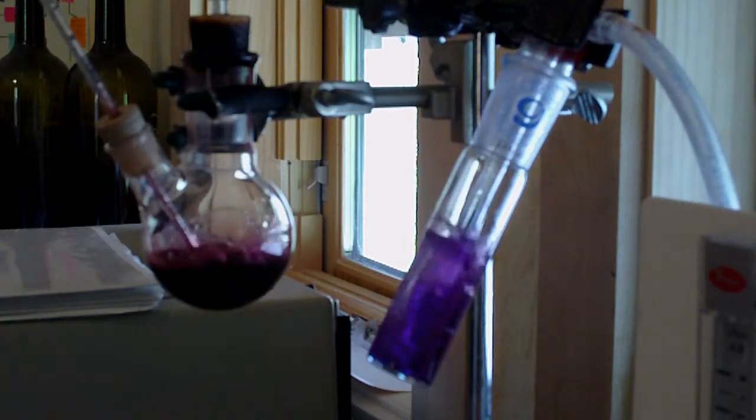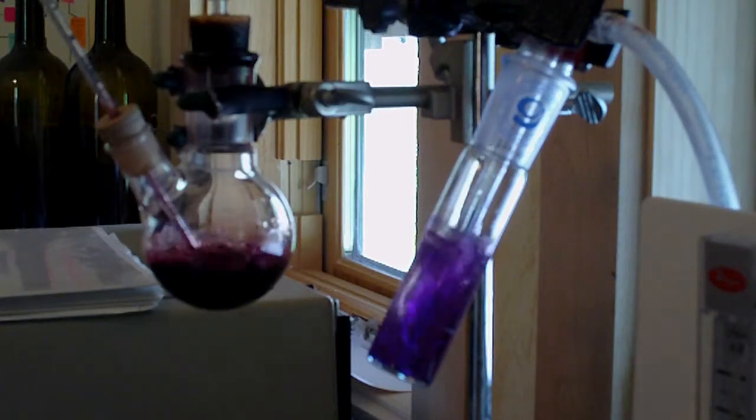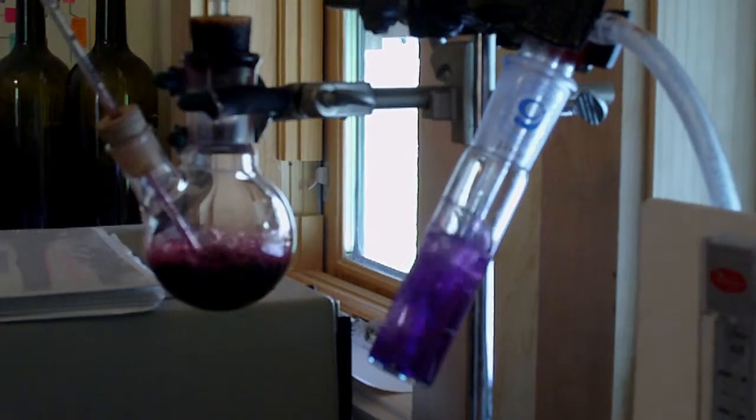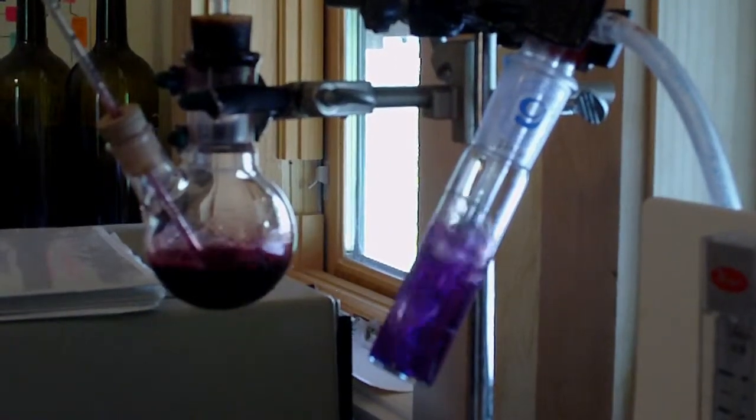It's definitely not what you want with a Pinot because it is so light to begin with. So how long does this test? This will go for like another eight minutes, so I can show you the other. Let's check something else out while this is going.